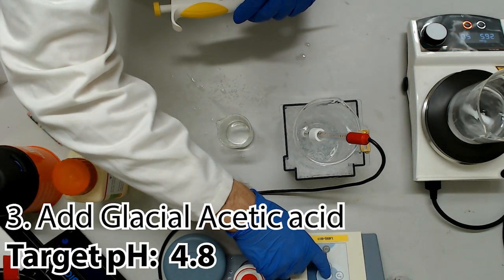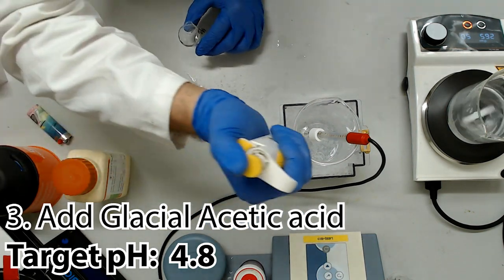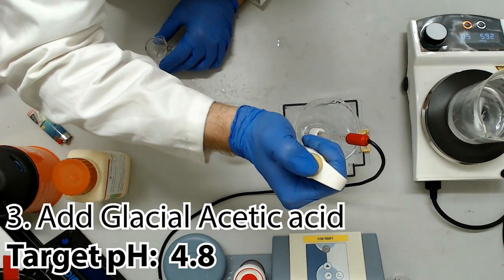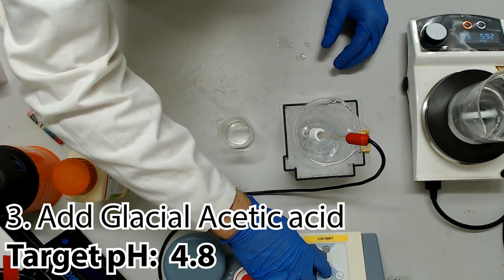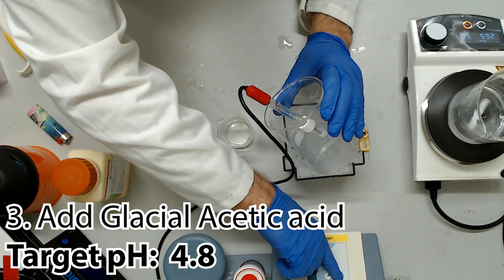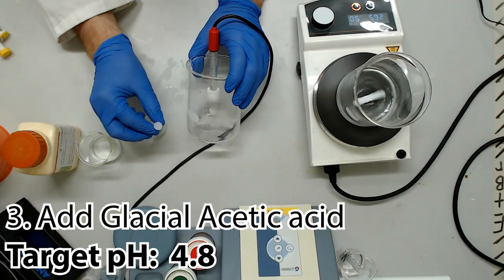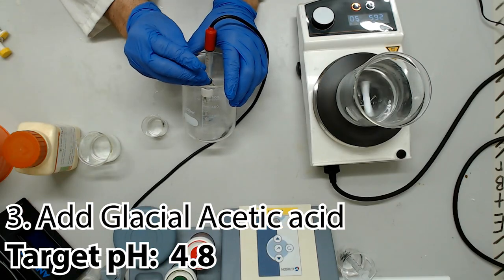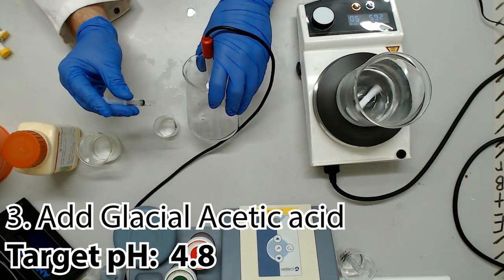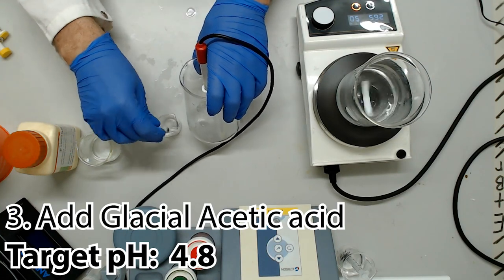Using a pipette, transfer glacial acetic acid from a clean beaker into your reaction volume. You may be getting close to your maximum volume, so be careful not to go too far or the dilutions will all be thrown off. It's going to take at least 5mls of glacial acid, so you can start adding pretty fast at the start. Once you reach the buffer zone for this reaction, it can proceed frustratingly slowly. Keep adding drops of acid until the pH finally reaches 4.8. If you overshoot, cautiously add a tiny bit of potassium hydroxide to bring it back up.